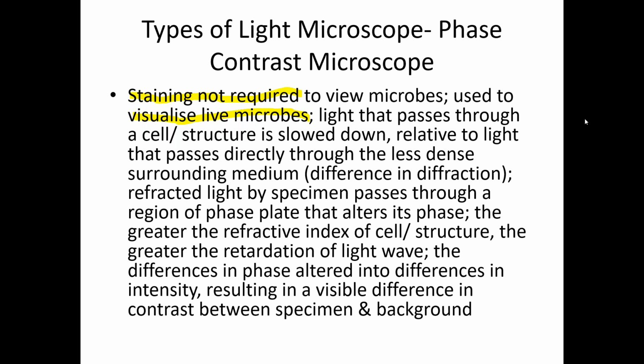Stab agar, not even stab agar, using microscope. Using microscope, have you done motility? Using a bright field microscope, we can observe motility. There is an experiment for that. We can see even E. coli, motile organisms like E. coli, or even Pseudomonas, or any motile organisms we can visualize.